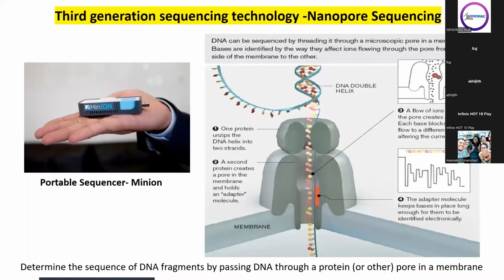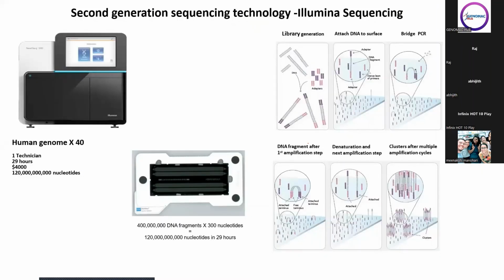Then the machine uses fluorophore-based sequencing. Every fluorophore is specific for a different nucleotide, like A, T, G, C, and each has a different color. The machine identifies all these colors, and then they form the DNA sequence.